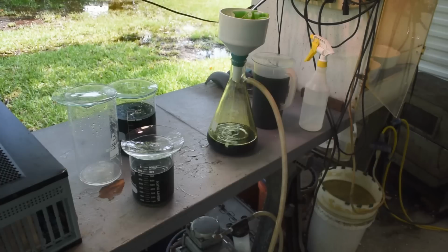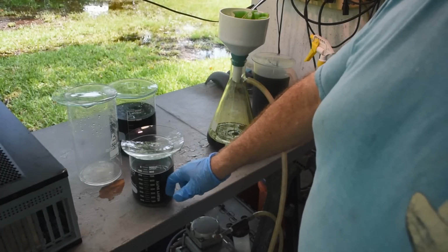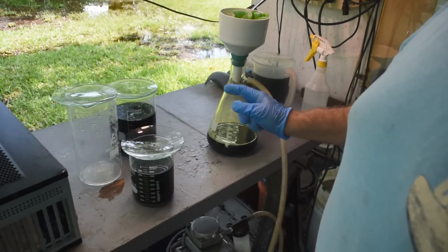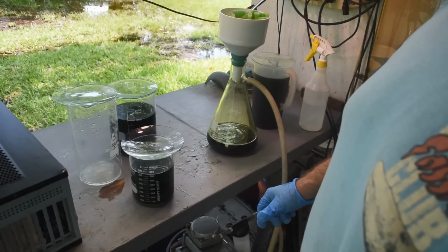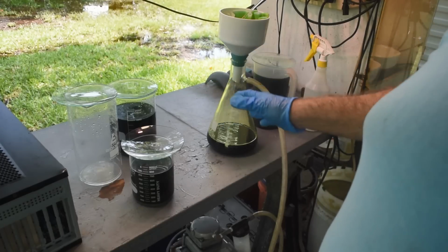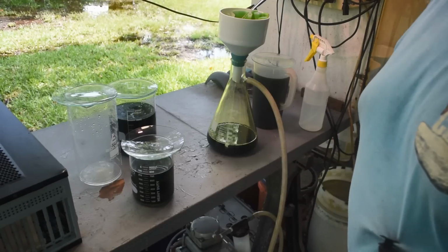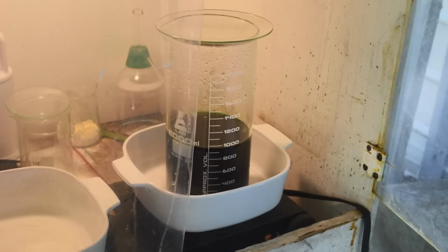Yeah, filtering all this liquid is going to take a while. In fact, I've decided that this liquid over here, which I was going to put in my stock pot, I think I'm going to filter it through too, and we'll see. I'm sure there's probably some palladium in this stuff, so we'll try to recover it. So I've already got this much filtered, this much, and I'm going to put this stuff through. I've got one more big beaker to go, but we may not wait for the filtration to finish before we start trying to drop some palladium out of this stuff over in the fume hood, because this filtration could be an ongoing thing. Yeah, that filtration is going to take a while. So in the meantime, we can get started.